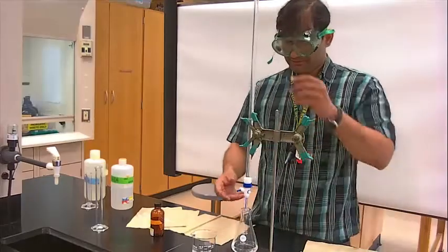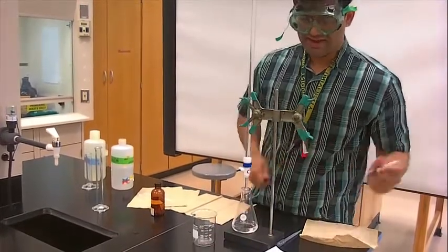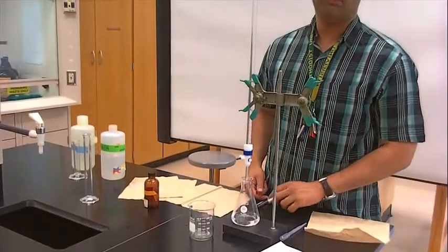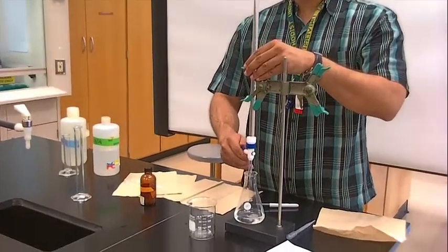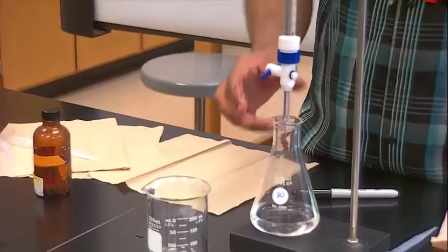So let's begin. All right, I like to just hold it like this. It's at 0.00. Usually we can write this down: 0.00 mils. If you started anywhere other than 0.00 mils, that will be your initial volume. So let's just go 1 mil at a time. And like I said before, we don't have to be exact. Okay, that wasn't exactly 1 mil. It was probably 1.10 mils.